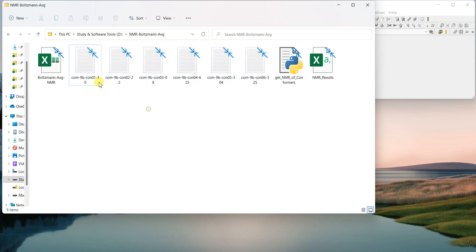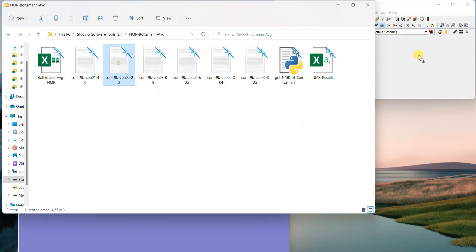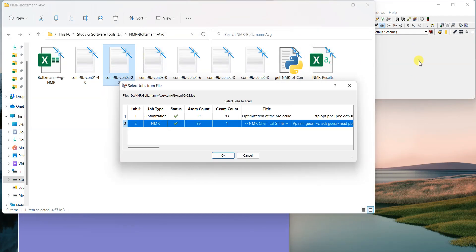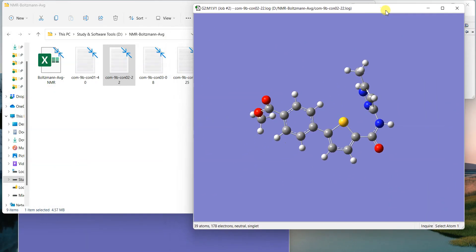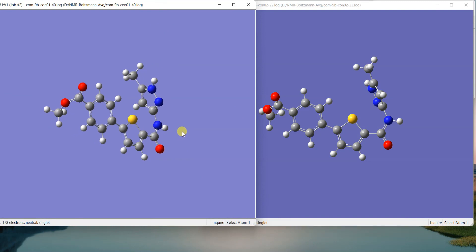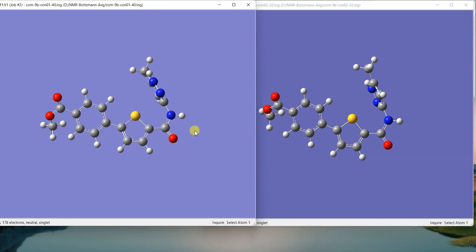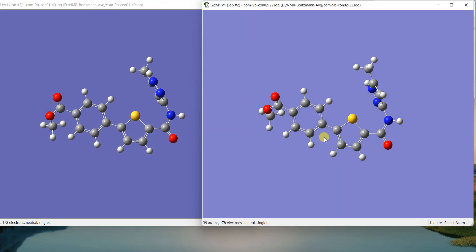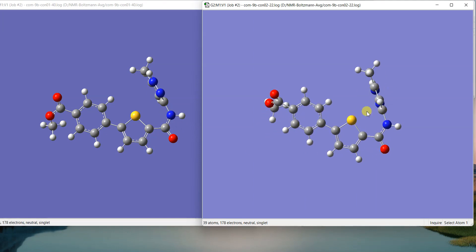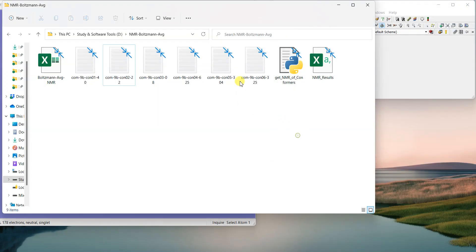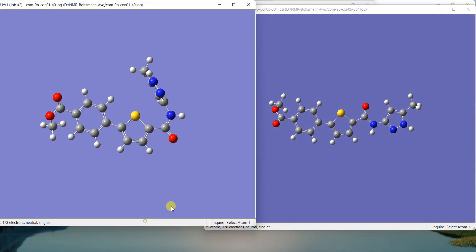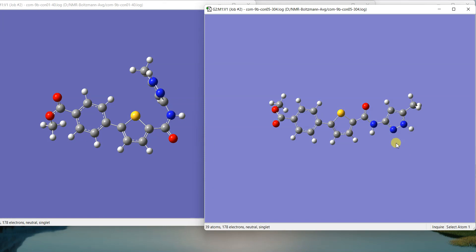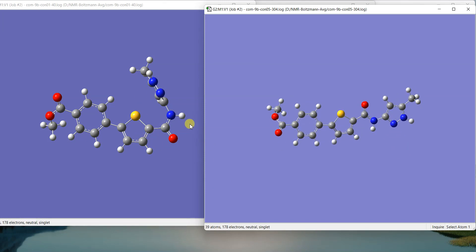For example, you can see that I have these six different conformations of the same molecule. Let's have a look. We can see this is one and then another one. If we check these conformations, you can see that they may have a difference in this bond or a bond angle. If we open different ones, you can see that different conformations have different shapes.